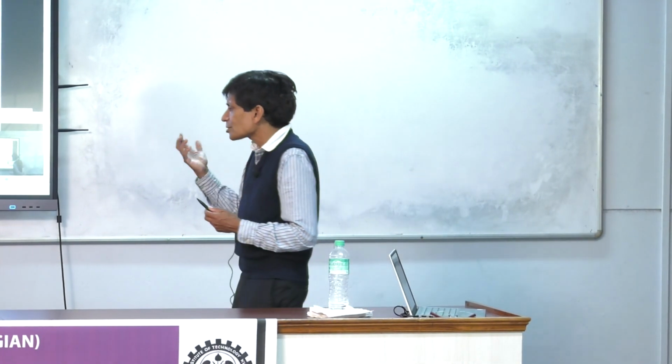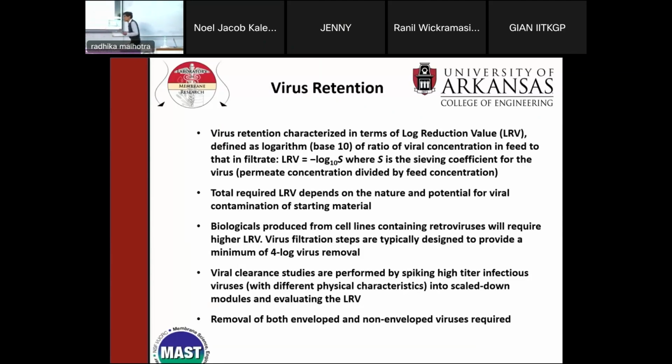The other thing is, viruses are not always perfect. You know, there are defective virus particles, there are broken virus particles, and so their DNA might be released anyway. And if you amplify that, that is not really helping you because you want to know about rejection of actual virus particles, not naked DNA as it's called. So that's why the actual infectivity assay is the best because that tells you how many of these viruses are viable. They are actually capable of infecting a cell. But anyway, it's a complicated process, okay?